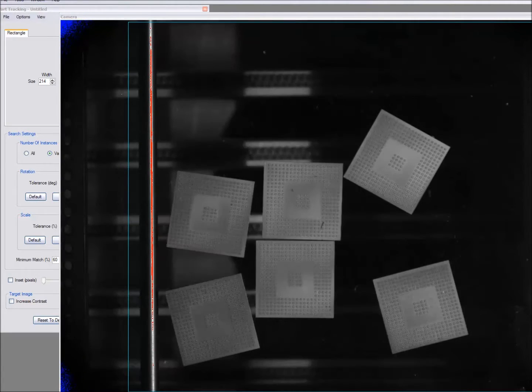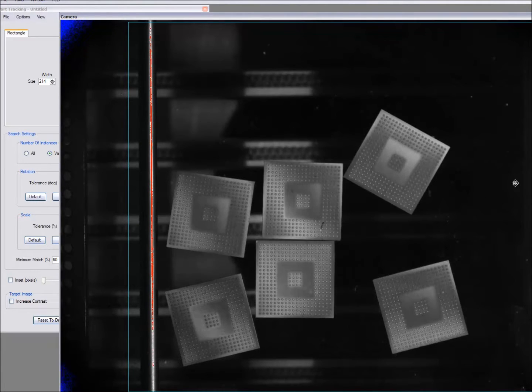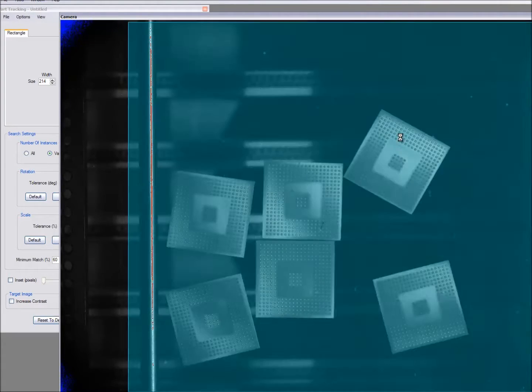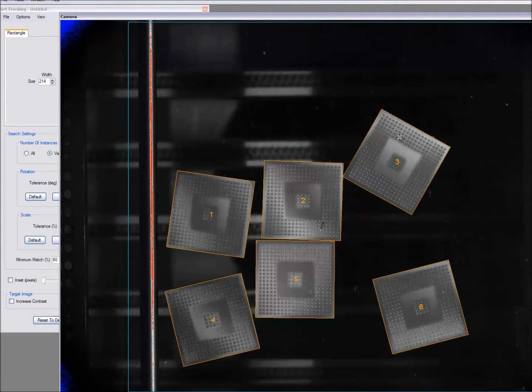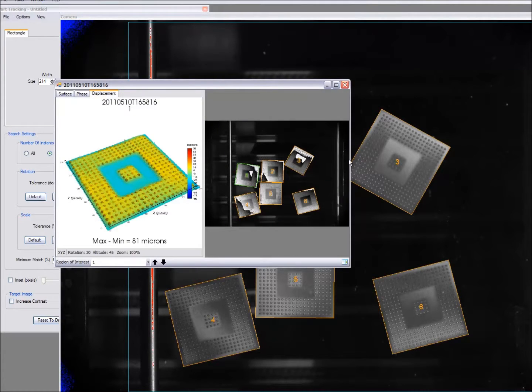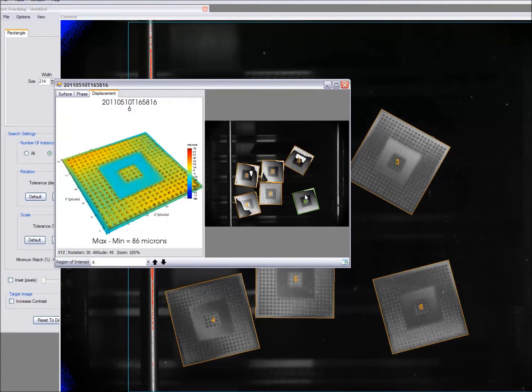Now let's look at testing these same samples with part tracking enabled. Watch this. Setup time goes from possibly tedious to very easy. You probably wouldn't just throw samples into your system, but with part tracking you actually could. Here we've located, partitioned, and can save both the phase data and displacement data immediately. Data partitioning is not required at all.